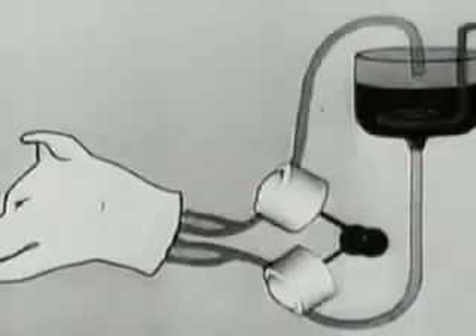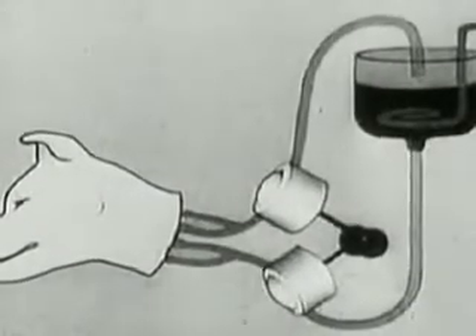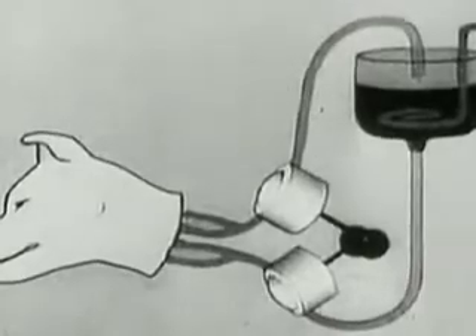An animal's head can also live in the isolated condition. Here is the plan of the experiment.